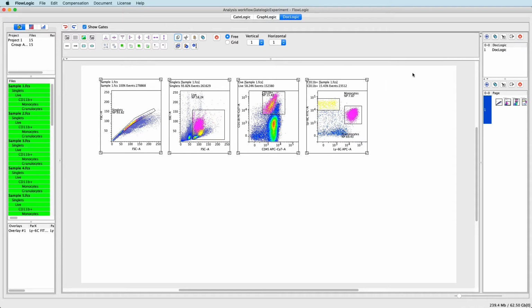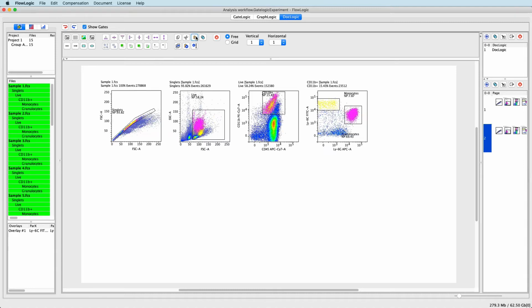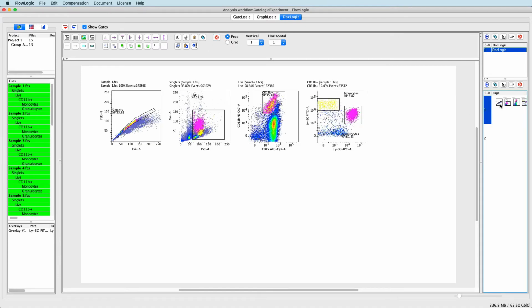Here you can see I can copy a selection of plots, add a new page to my report, and paste them into the same position on the second page. Other icons in the toolbar allow you to insert a text box, table, import an image, add a keyword text box, add lines, arrows, and shapes.